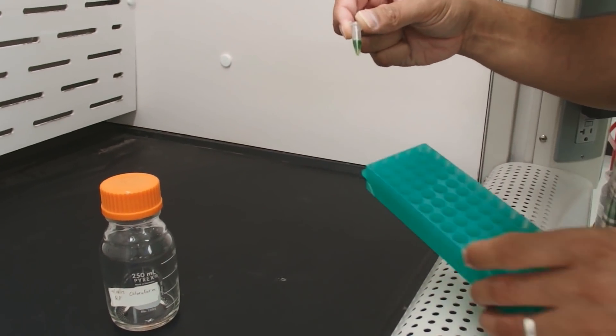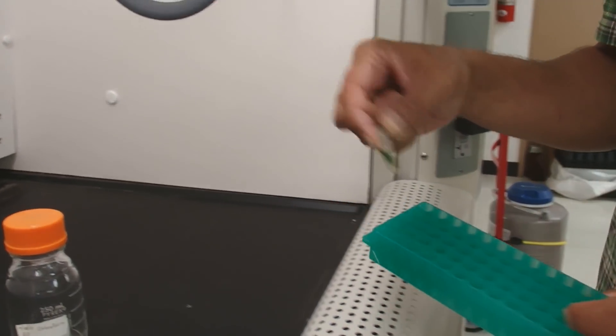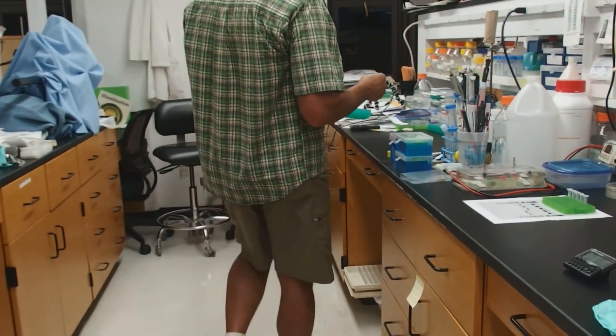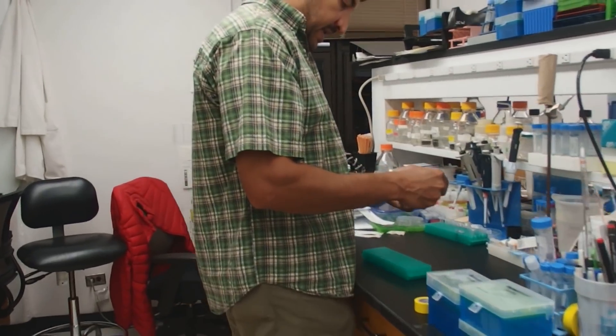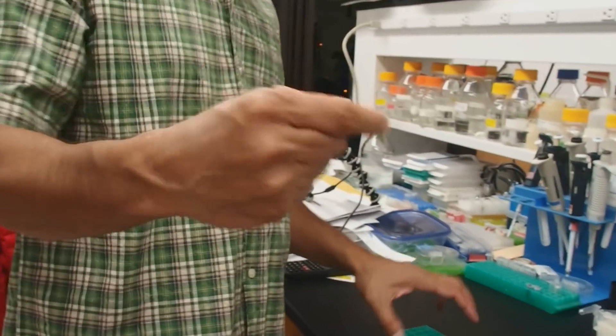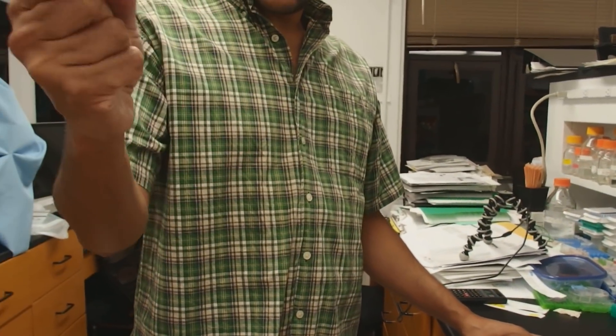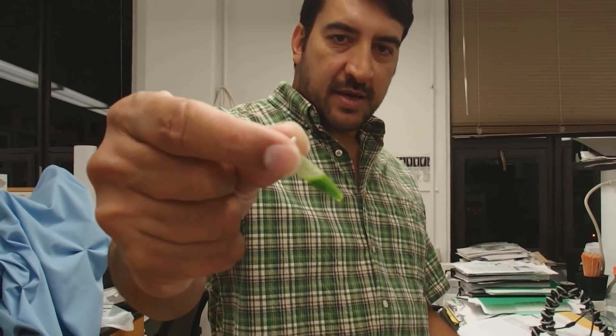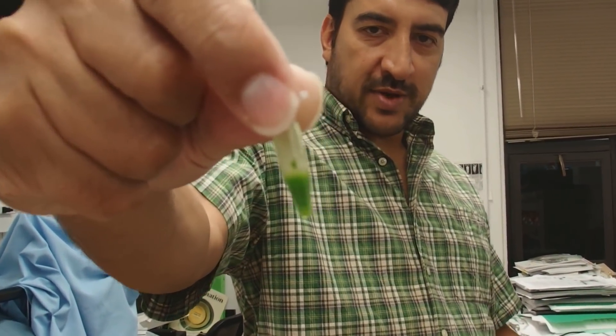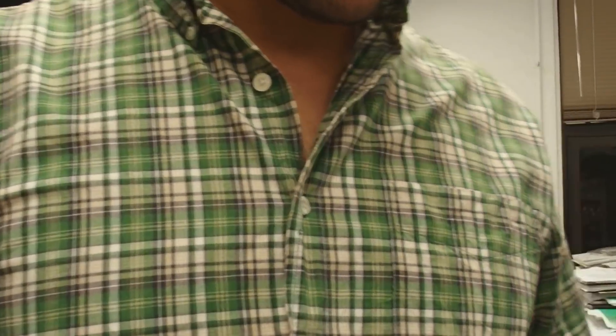Now we need to homogenize this, so we'll go back to the lab bench. Homogenize that by shaking so it looks like a milky substance. Milky green substance for plant material.